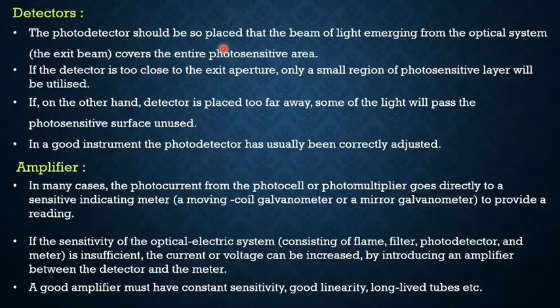It is not too close or too far from the optical system. In a good instrument, the photodetector has usually been correctly adjusted.